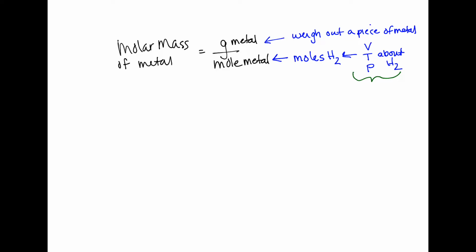We also need to be able to measure the volume of it and measure the temperature of it, and somehow find the pressure. So to do that, we're going to use a burette that's been inverted. Now at this point, it might be helpful for you to pause and go to the lab setup video so that you can see the actual procedure here.